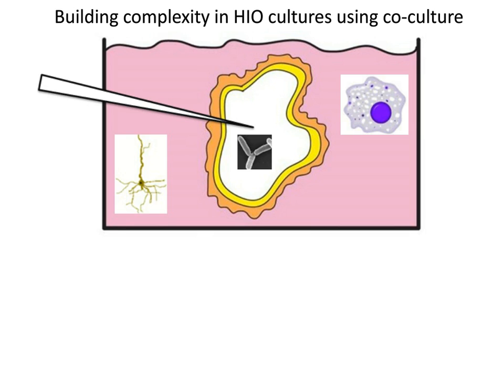And so we think that we can continue to build increasing biological complexity by adding immune cells into the dish to understand how the immune cells might influence the epithelium, or how an immune cell might respond to a bacteria within the lumen of this organoid. We can start understanding this crosstalk between different tissues and different cell types.